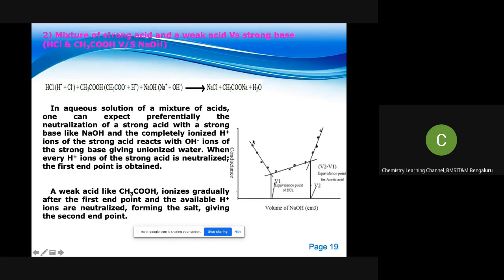So you can see, right, I have got this kind of graph here. So first the readings decrease, then they will slightly increase, then they will rapidly increase. So take down the last reading until you get back the reading which is close to that of the first reading, almost near to that of the first reading. Okay, so until then you carry out the experiment. So what we observe here is initially the readings will go on decreasing, then they will slightly increase, and then they will rapidly increase. So why is this going to take place?